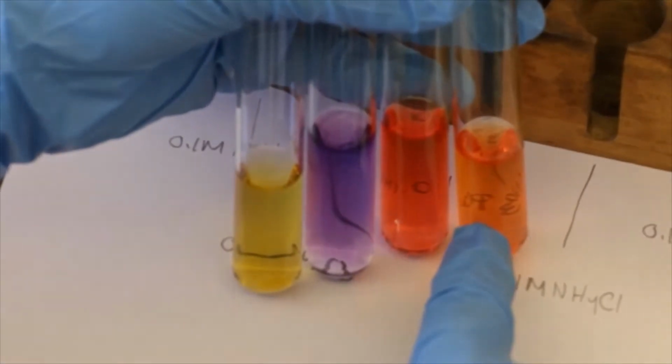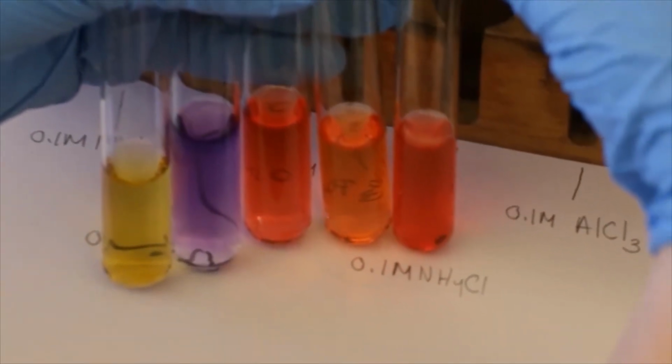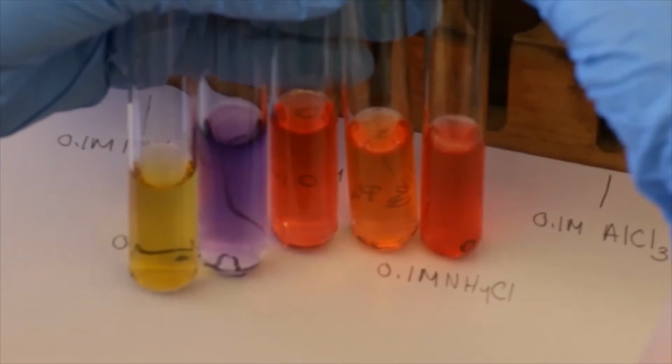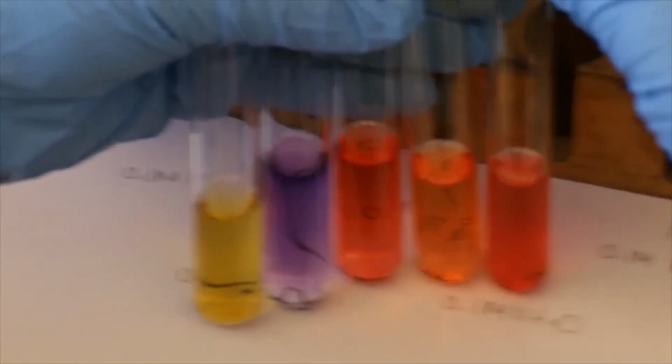NH4Cl is definitely an orange, not so much red. And then AlCl3 is a deep dark red. So there they are for you. Those are the pHs of the salts.